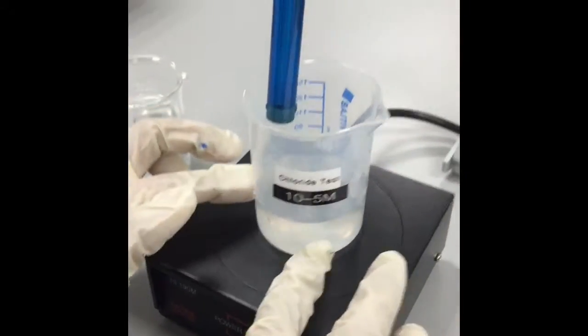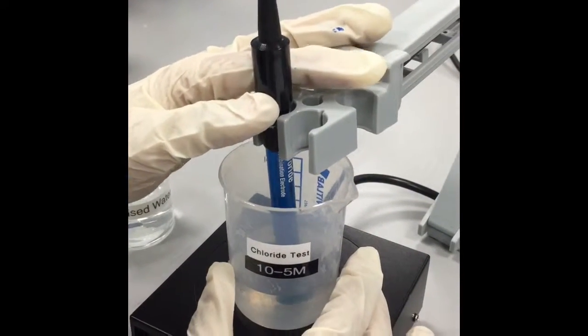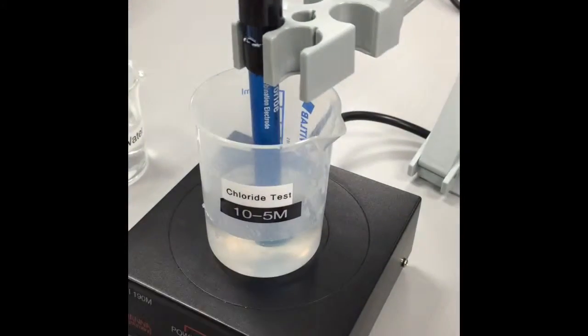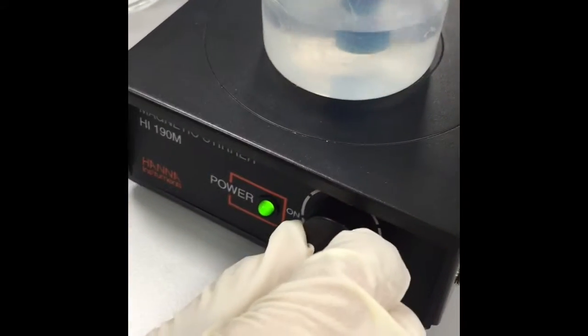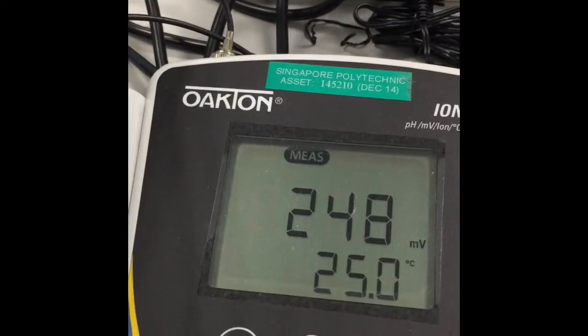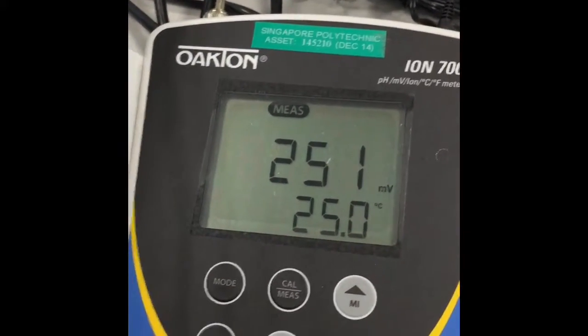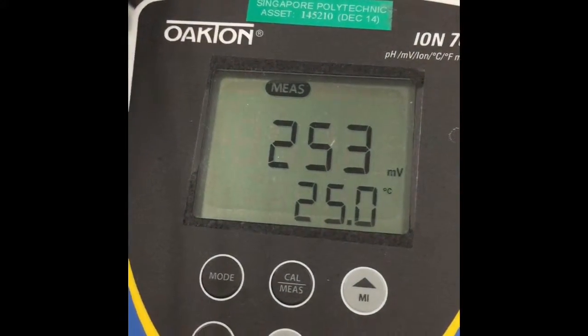After you have done so, place your beaker in the middle of the magnetic stirrer and submerge the electrode into your chloride test 10 to the power negative 5 beaker. Please repeat the same procedure for negative 4 and negative 3, for chloride and nitrate tests. Switch on your magnetic stirrer so everything is well mixed and your meter stabilizes, and from there you can take your readings from the machine.